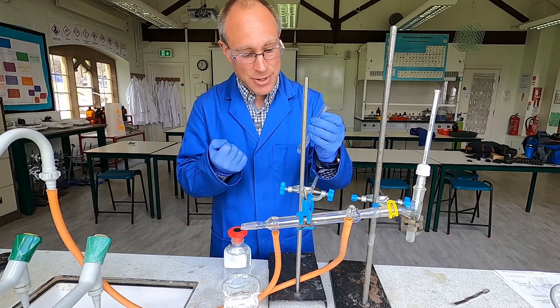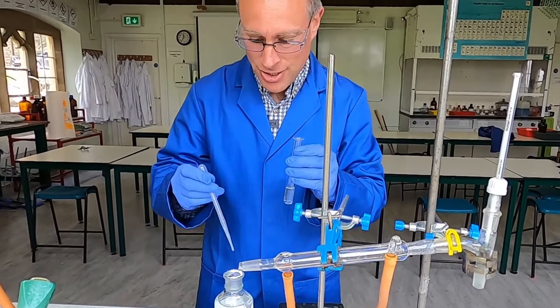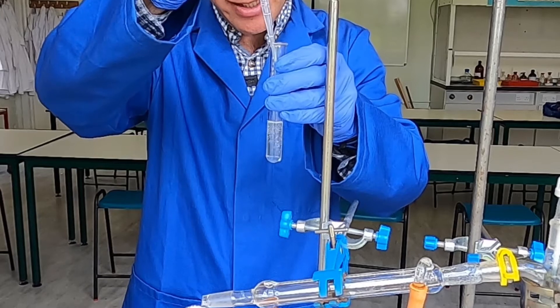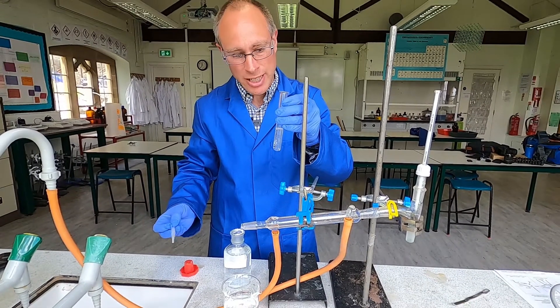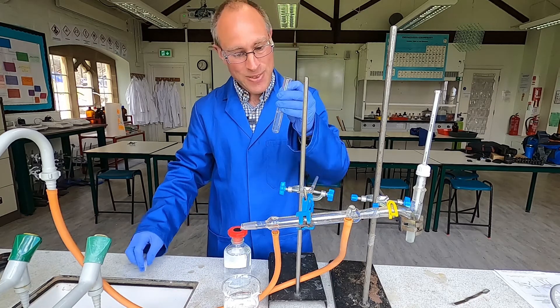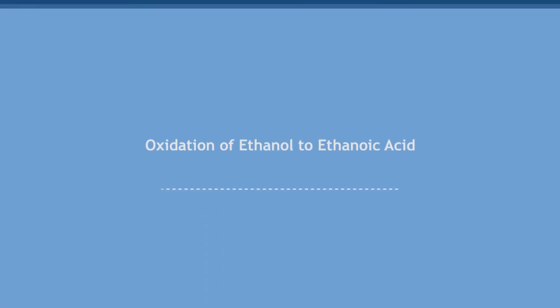So here's the ethanoic acid which I obtained. It definitely smells of vinegar. Just going to add a little bit of sodium hydrogen carbonate to the mixture — and you can definitely see effervescence there. So we've definitely got an acidic solution. The smell, which you obviously can't smell through the screen, and the reaction with the carbonate showing the production of ethanoic acid. Successful experiment.